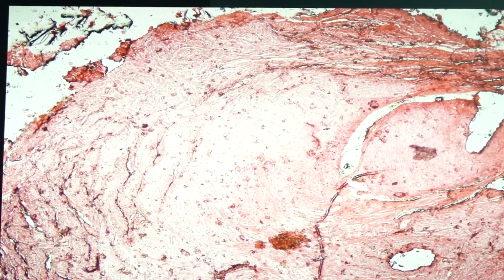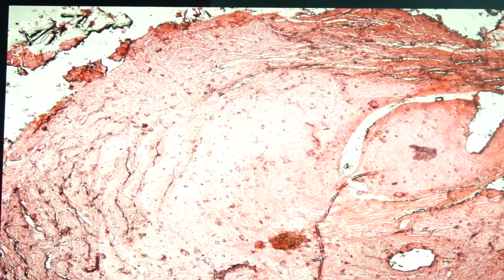So now we go to slide 208, and this is Leiomyoma. Sorry class, this is not a good slide, although we can still appreciate the presence of those muscle fibers. So please bear with me.